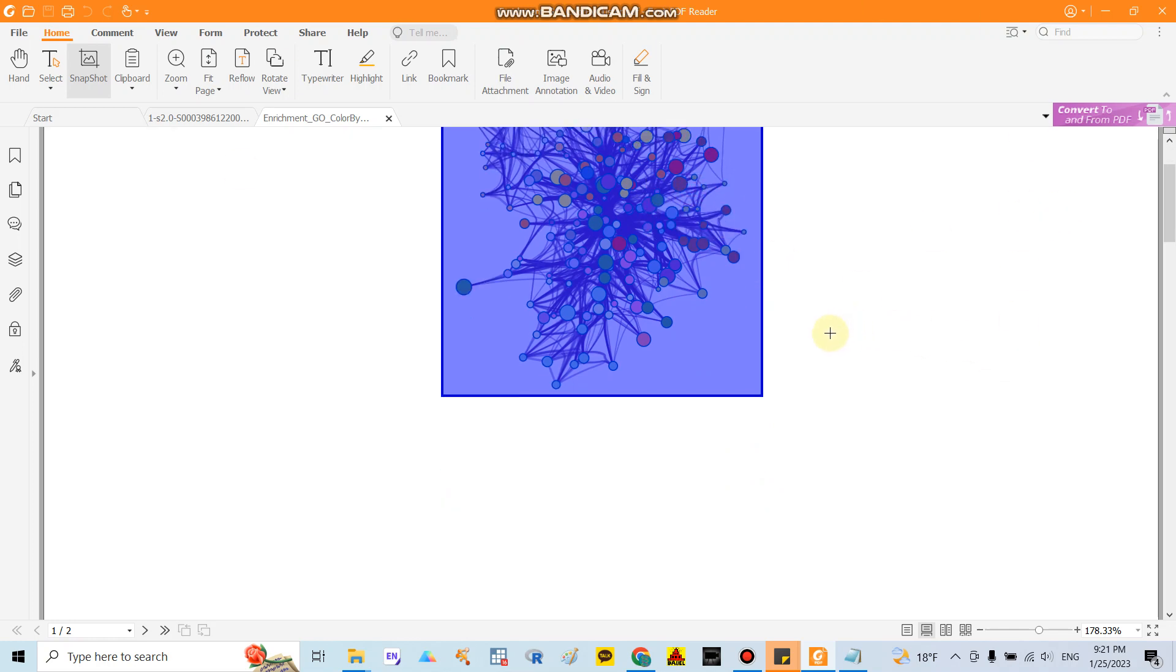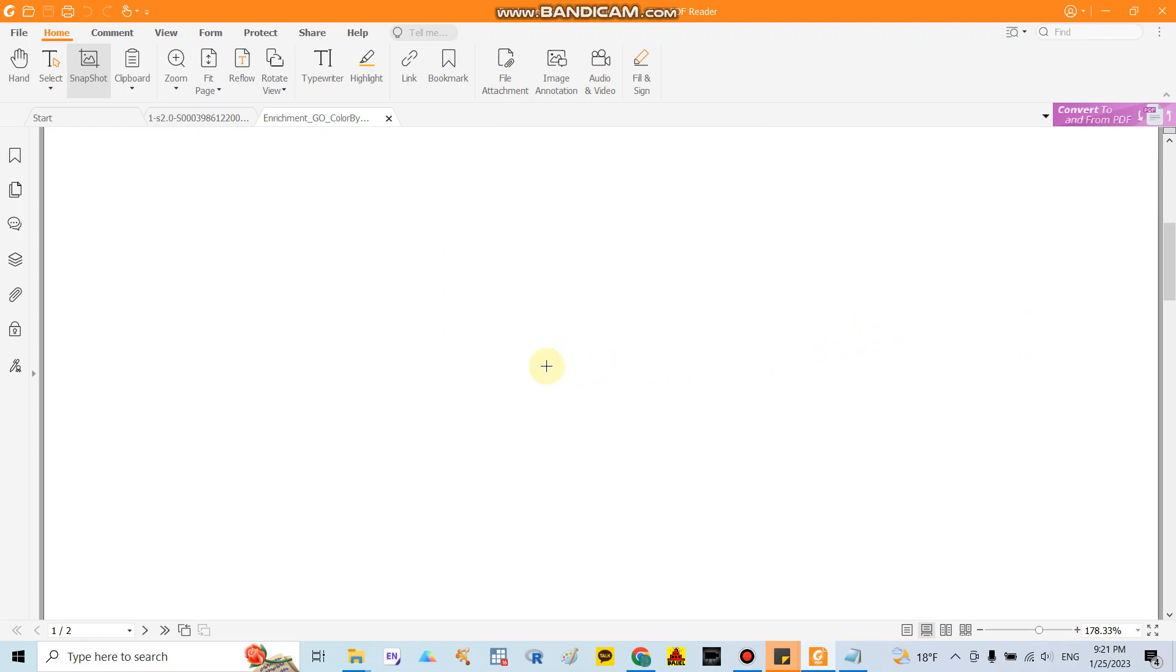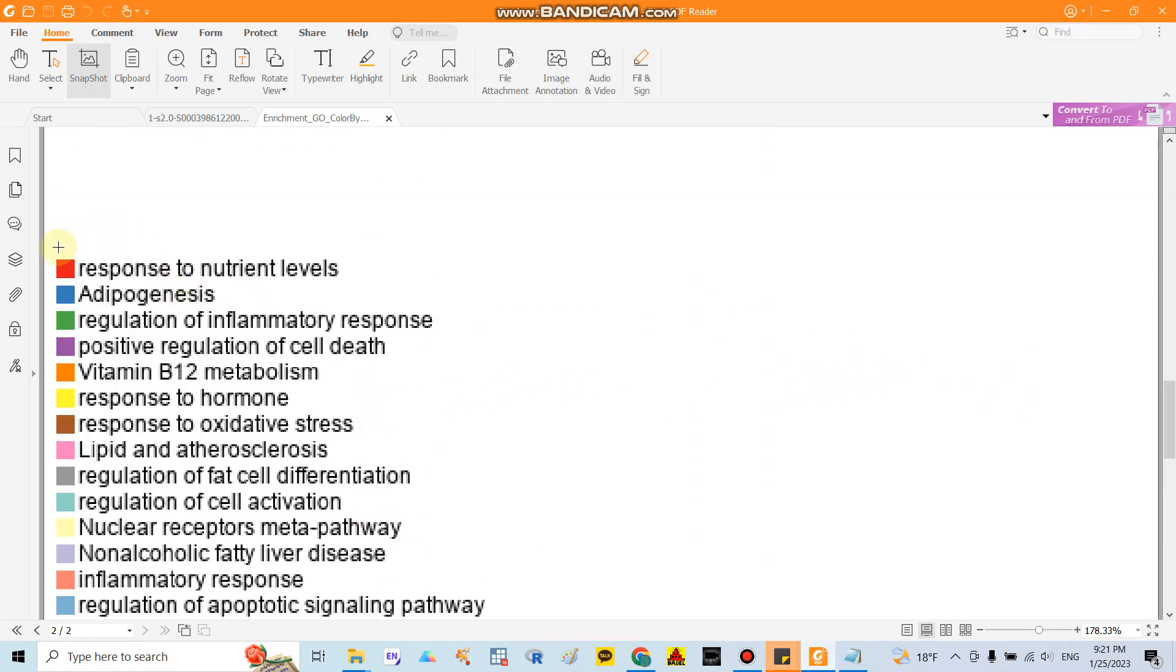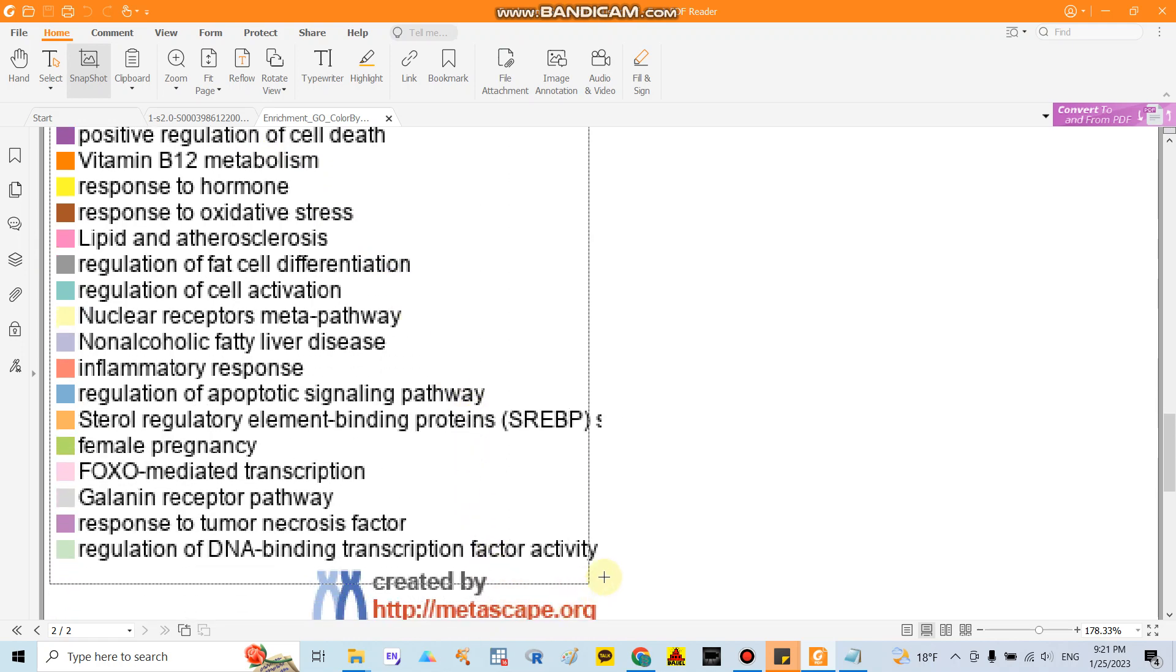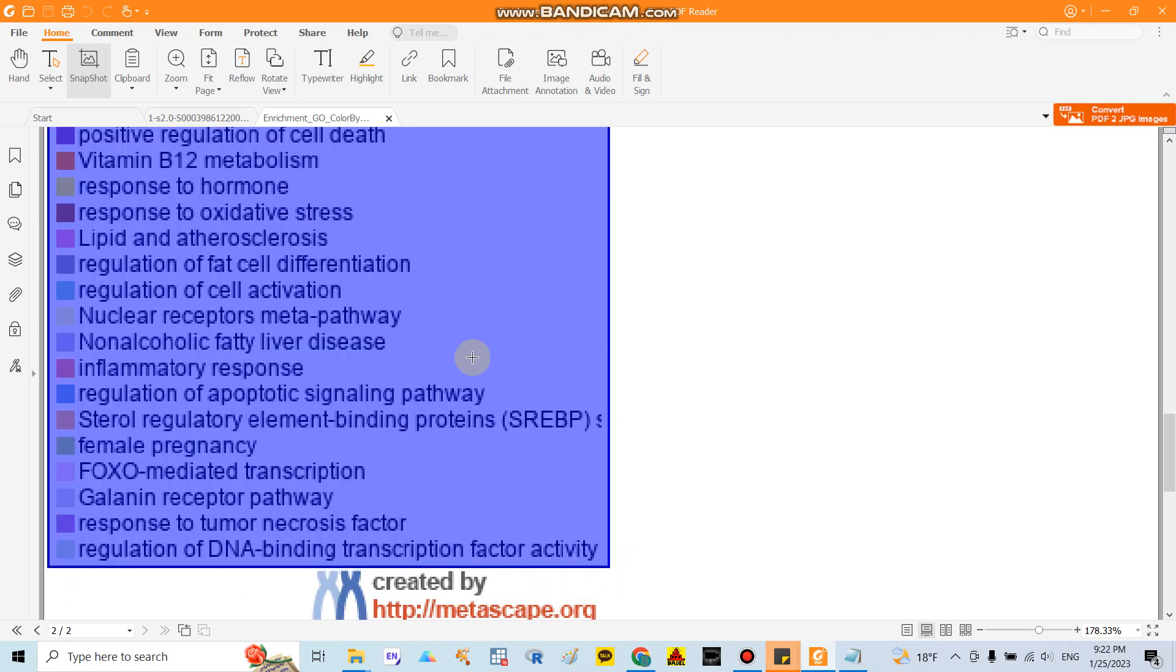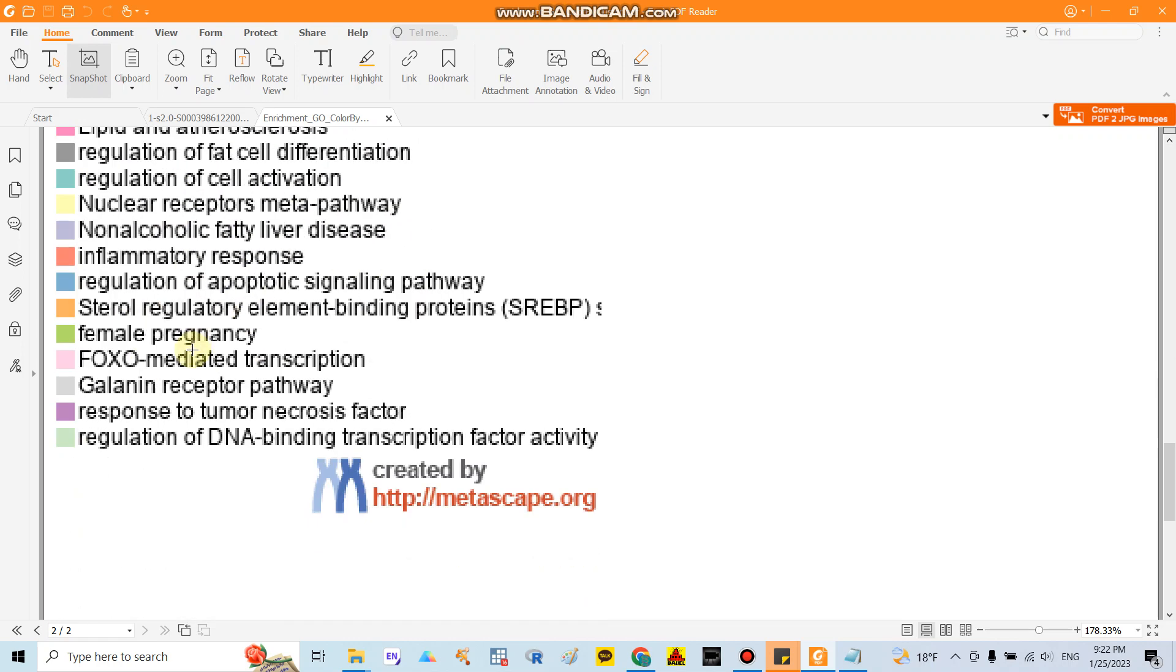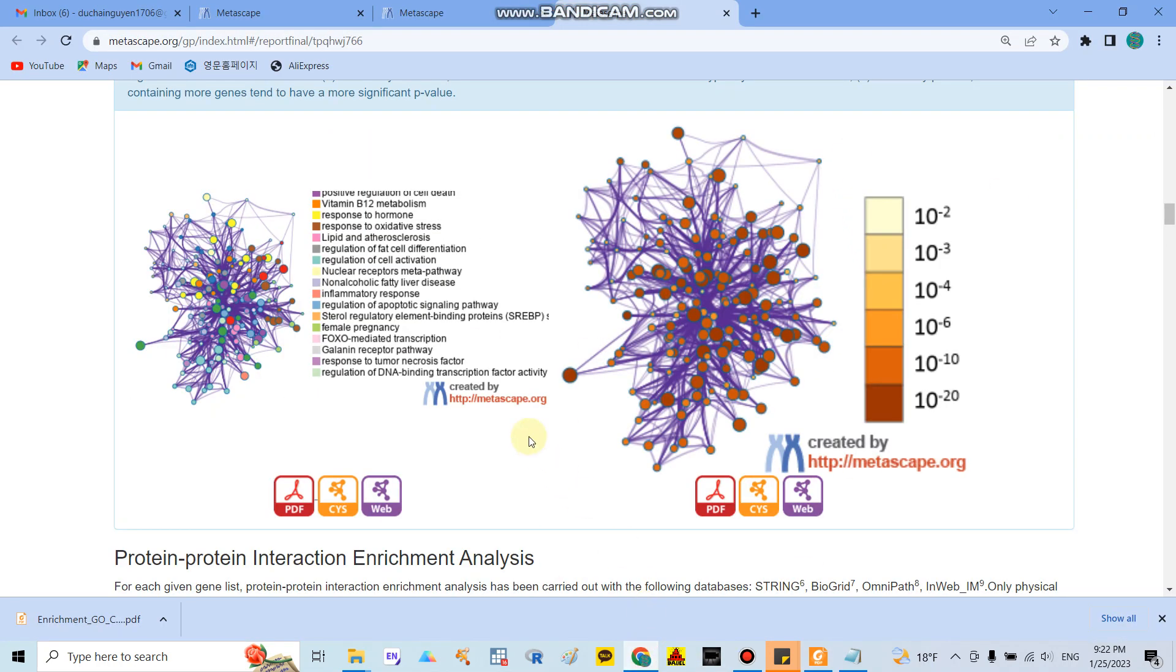And below here they will mention about a color, color representative for pathways. For example here the red one representative for response to nutrient levels, the blue one present for the adipogenesis.